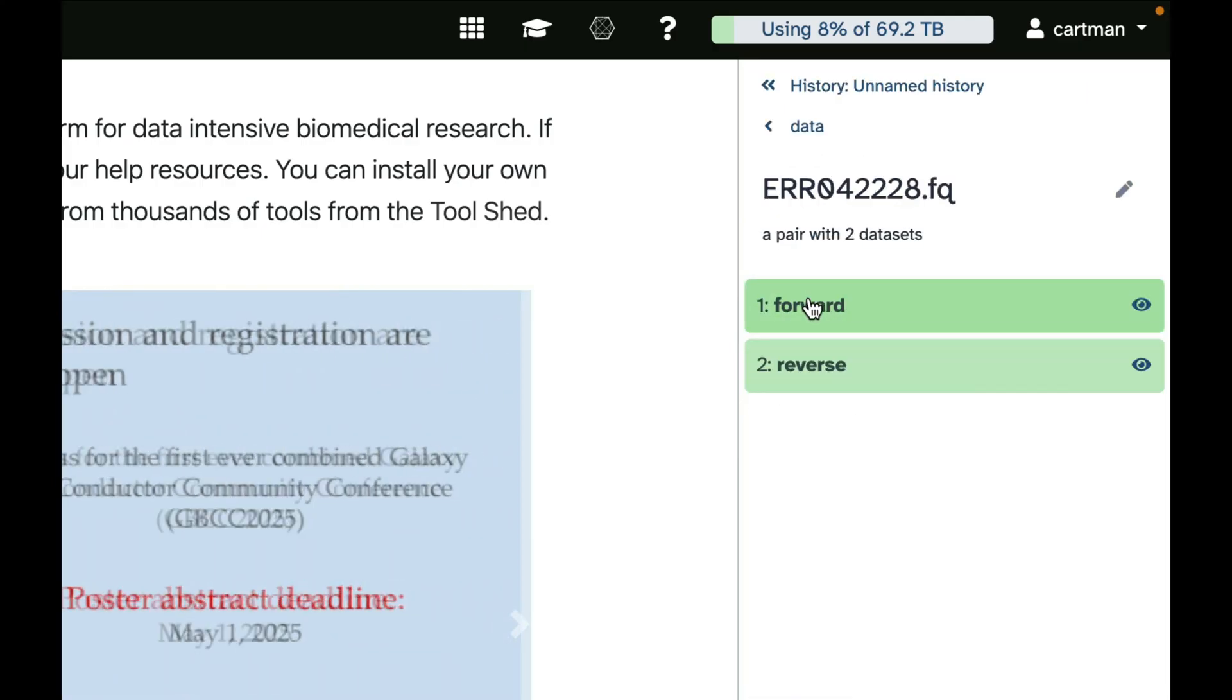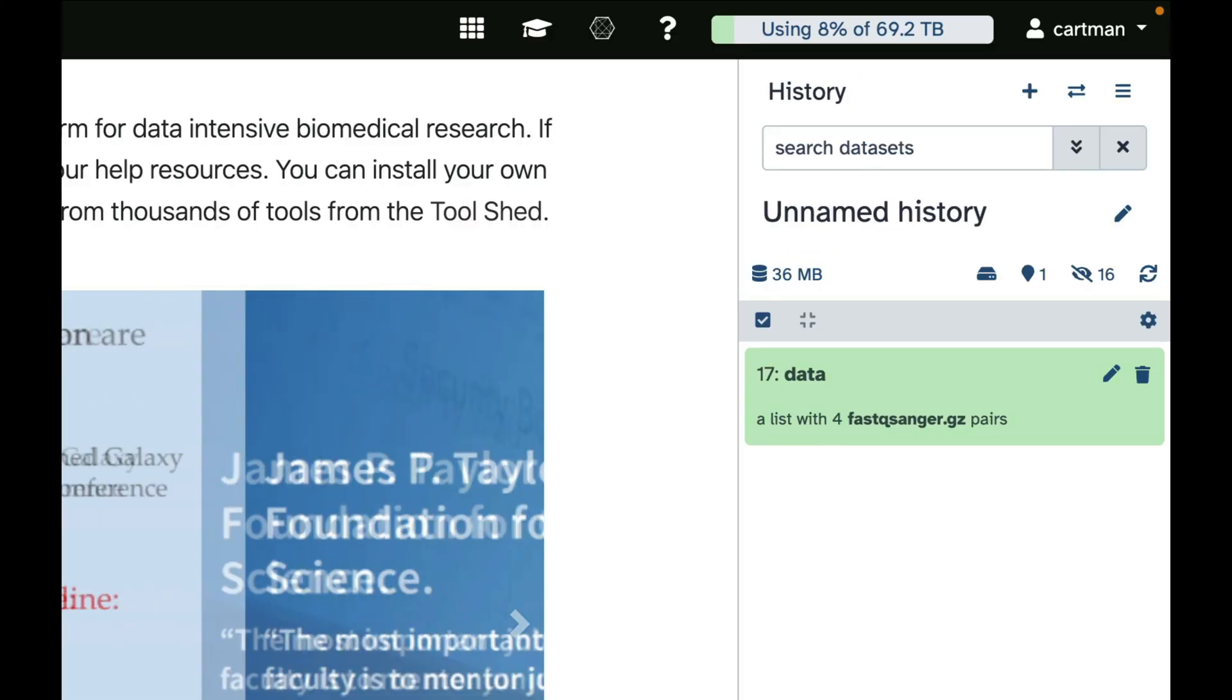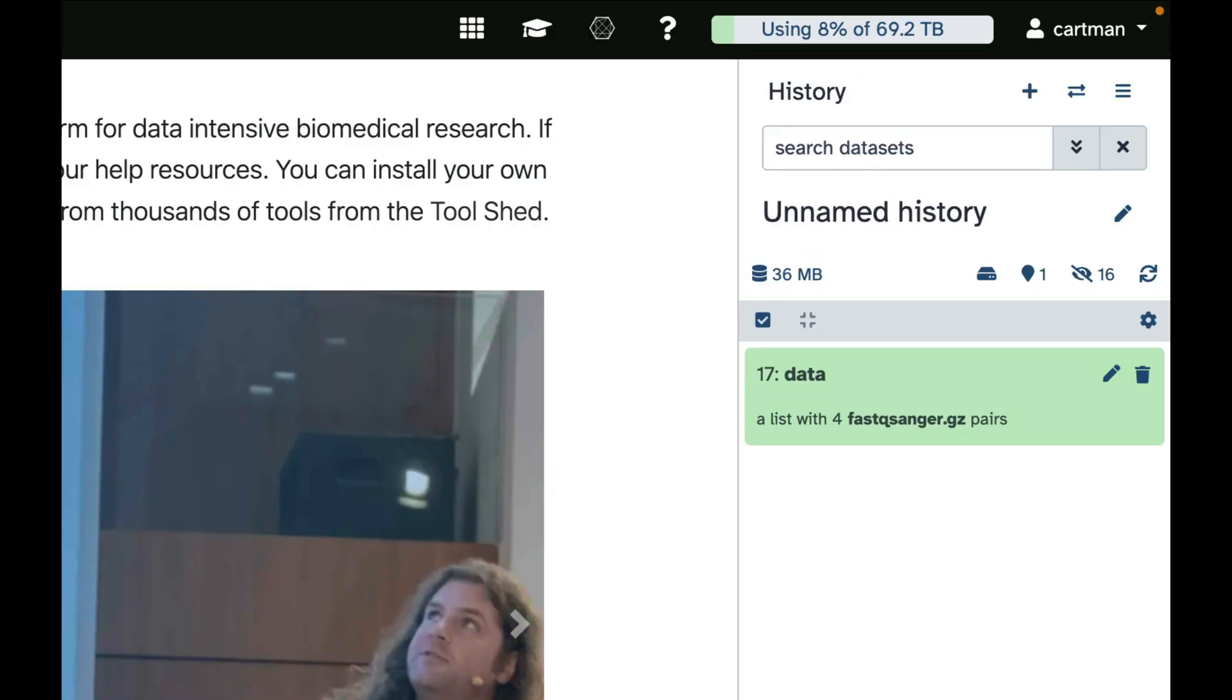All Galaxy tools know how to handle collections.